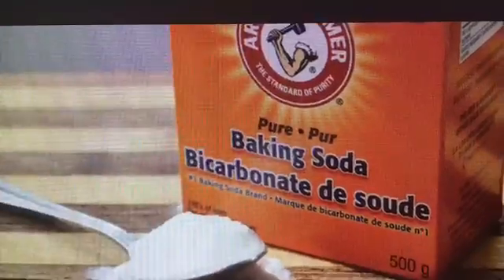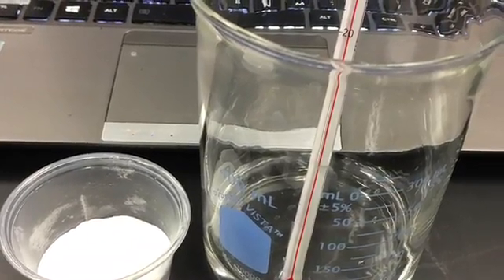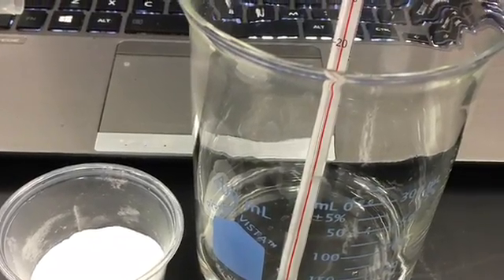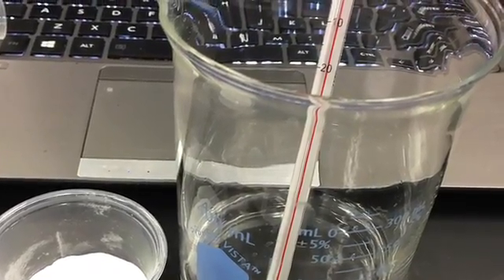Experiment number one: we used baking soda and acetic acid. First, we carefully measured 10 grams of baking soda in a plastic container, then we placed it into 50 milliliters of acetic acid in a 400 milliliter beaker.